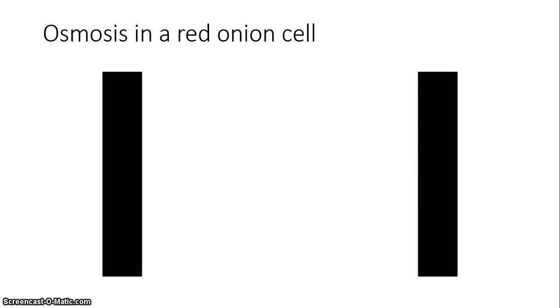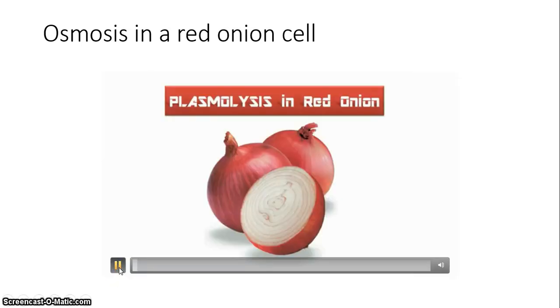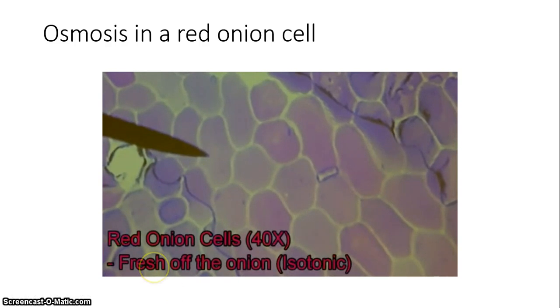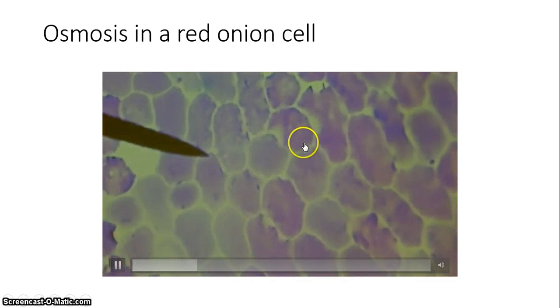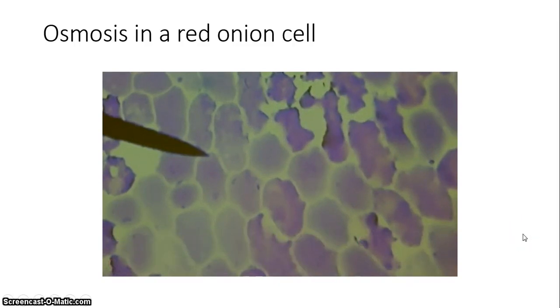We watched this video the other day, and this will show you plasmolysis in the red onion cell. Here you see the isotonic state, and then the salt water solution. You can see the cell membranes pulling away from the cell wall because all of the water is flooding out, and so the cells are shrinking.